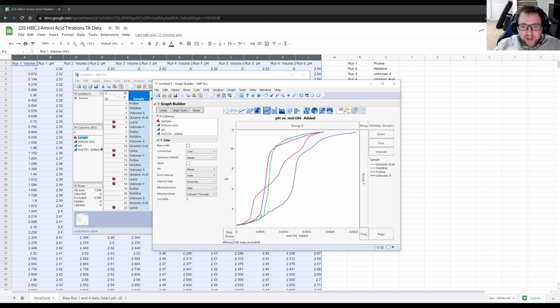All right. Yeah, let's do it. Okay. We've got a couple options on how I want to do this, and we're doing it live.